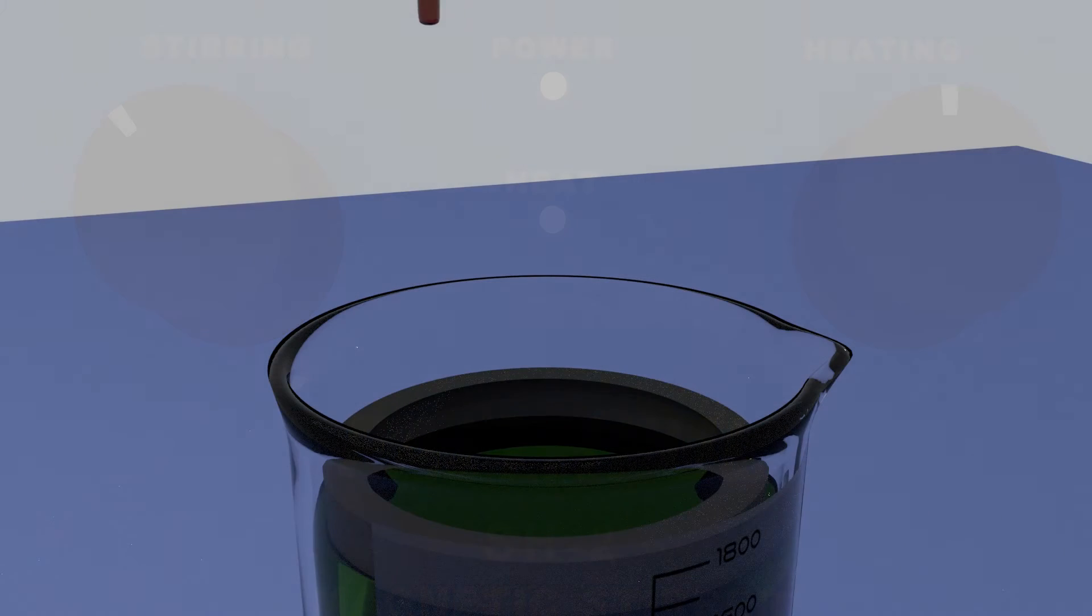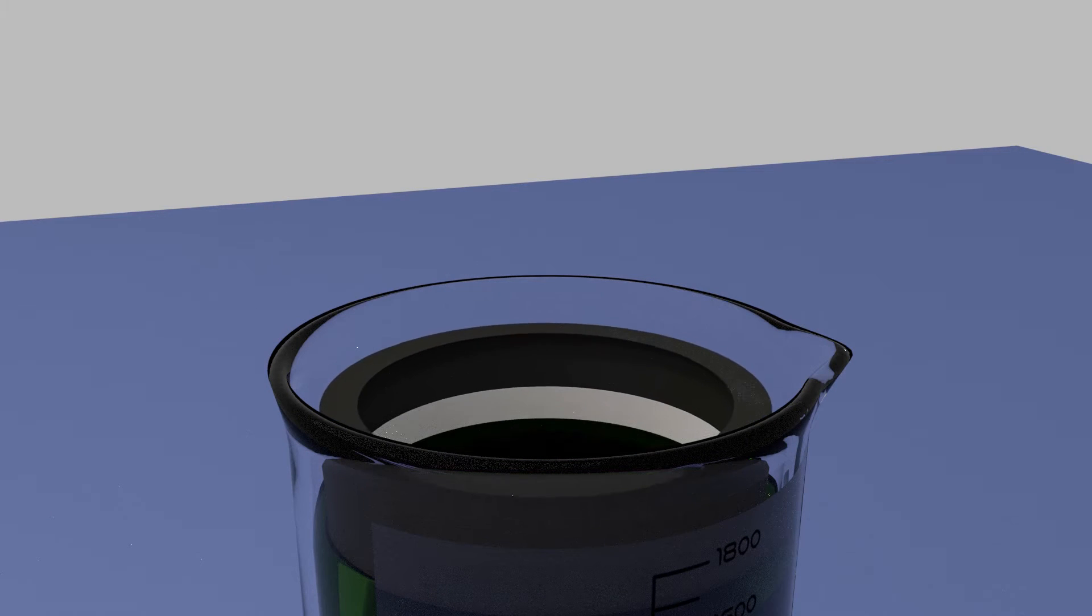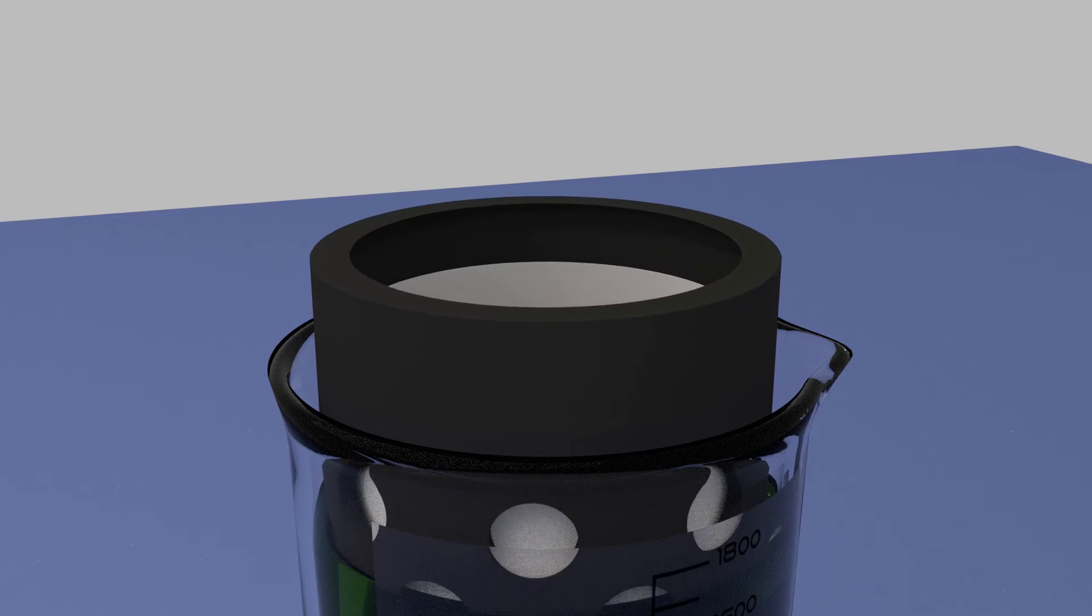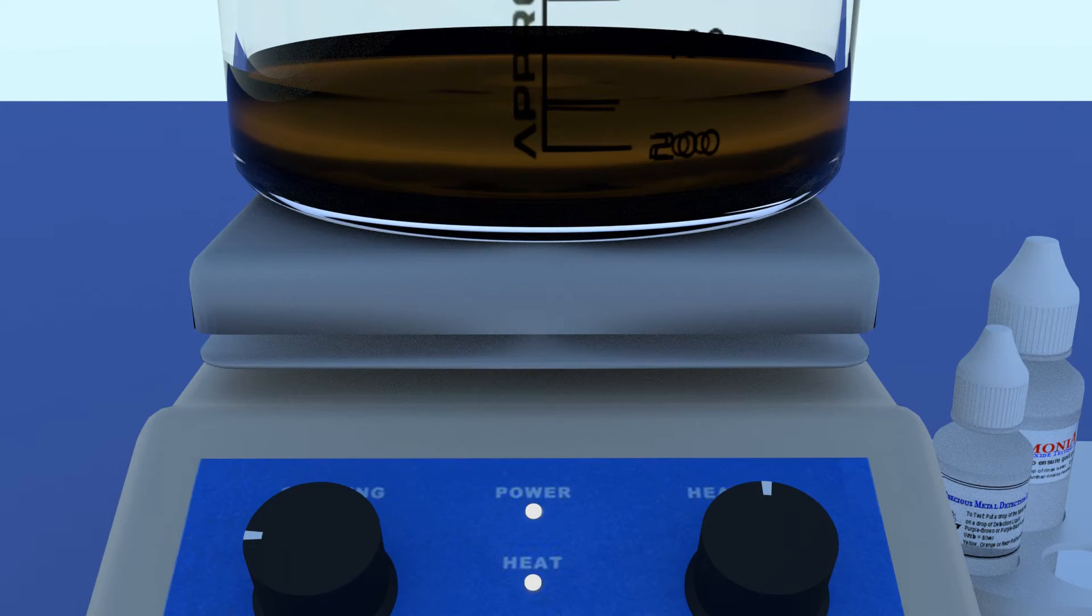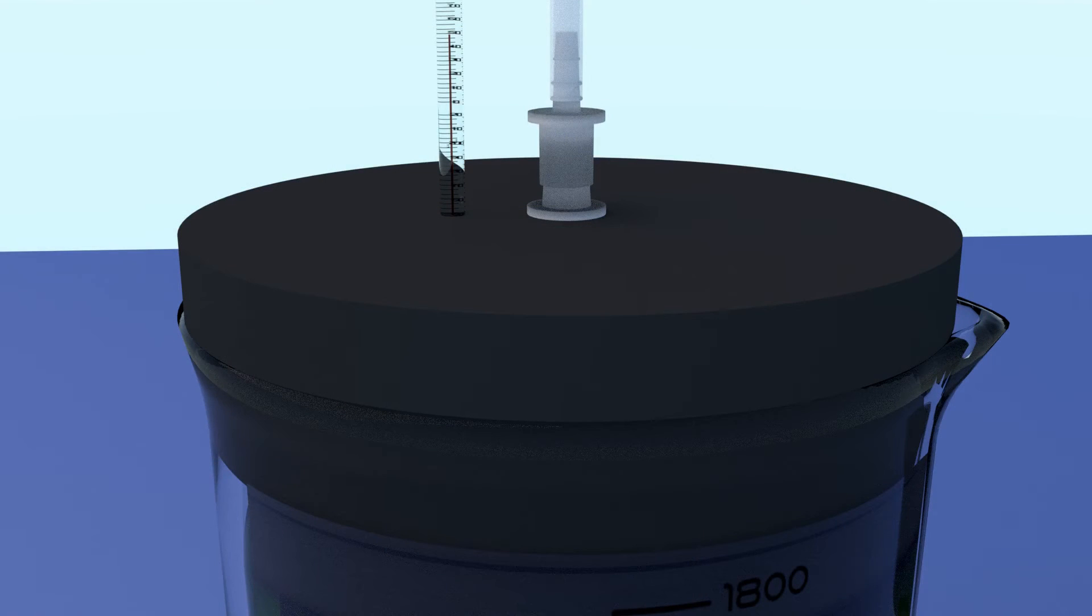When all the metal has dissolved, it's time to separate undissolved materials like diamonds, for example, from the solution. And after that, we'll recover the purified gold. So let's disconnect the scrubber and take the beaker to a well ventilated area, preferably outside.